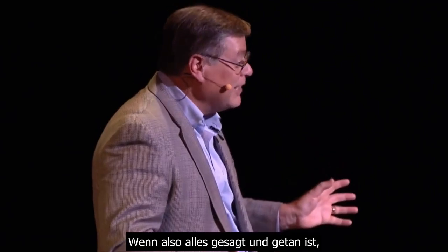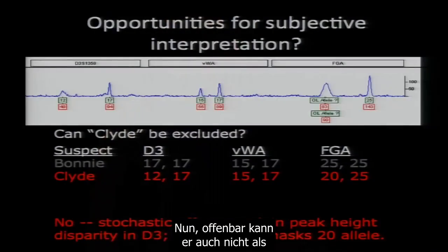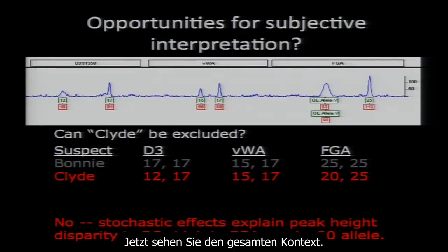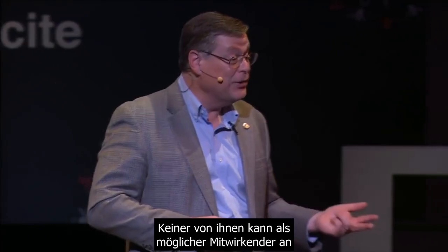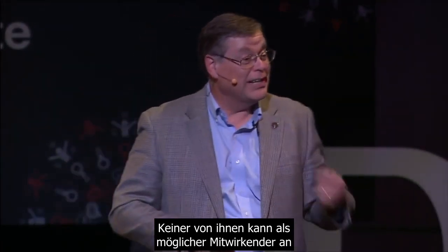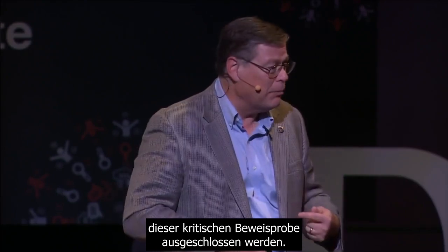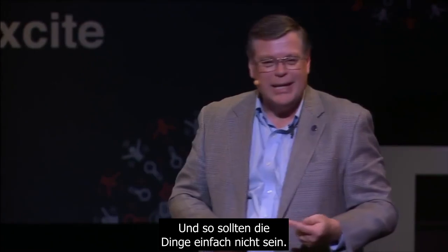So when all is said and done, what do we conclude about Clyde? Well, apparently, he can't be excluded as a possible contributor either. Now, you guys see the whole context. There's a problem here, isn't it? We have two different people with different DNA profiles, neither of whom can be excluded as possible contributors to this critical evidence sample, right? And that's just not the way things are supposed to be.